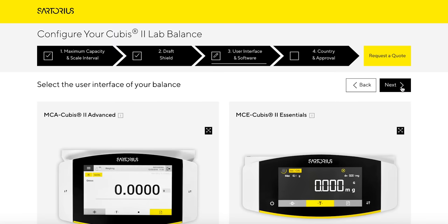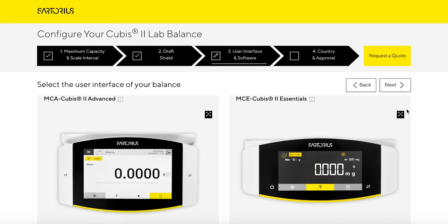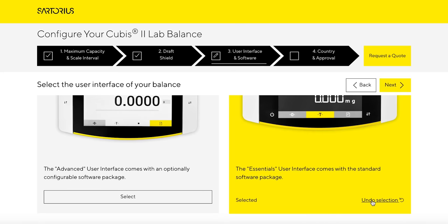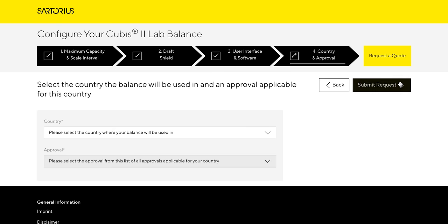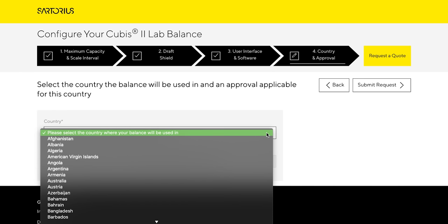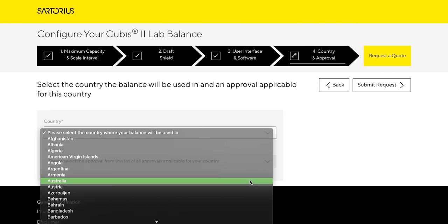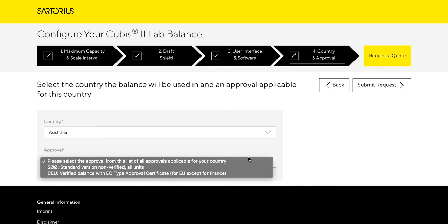Now select the user interface and software of your balance. And finally, select the country the balance will be used in, and an approval that is applicable for the selected country.